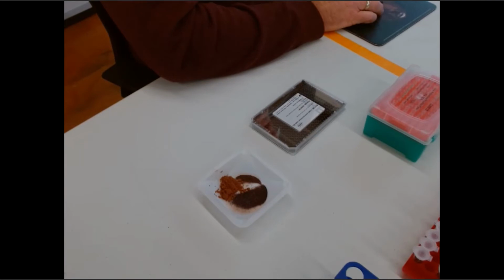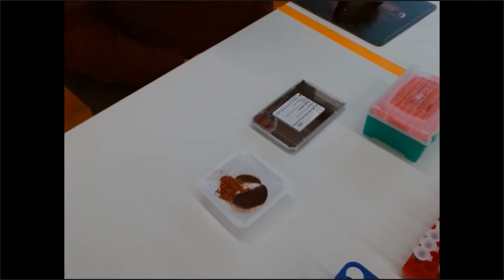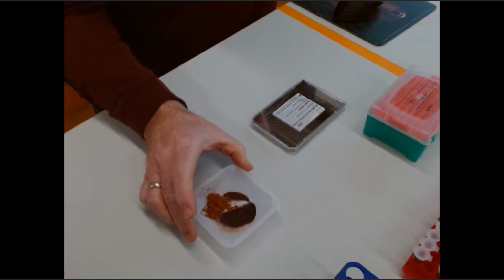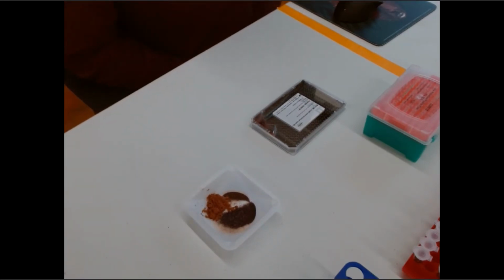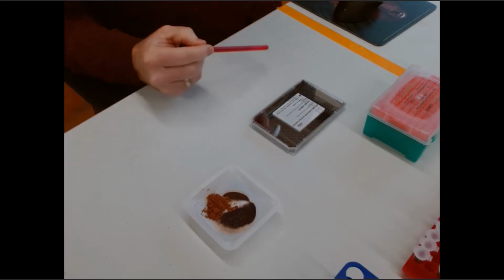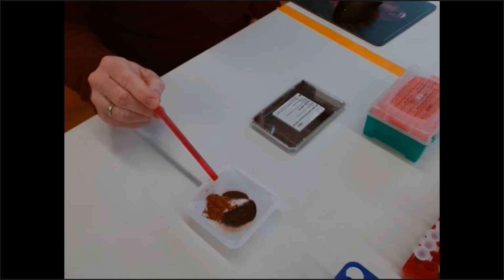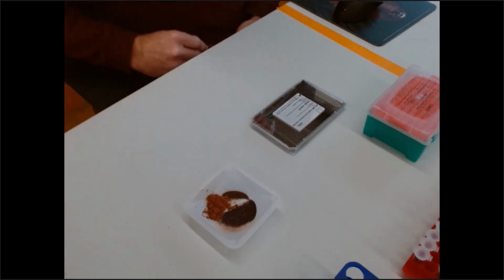Okay. So what everybody should be able to see now on their screen is a sample of grapeseed extract. And actually, I have 3 individual samples of grapeseed extract here. You can see one up in this corner, one down over here, and another in this corner.